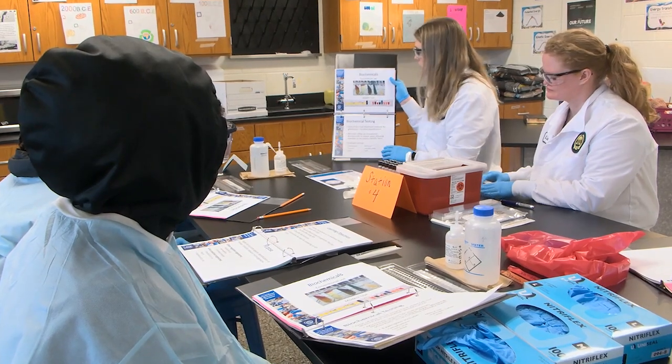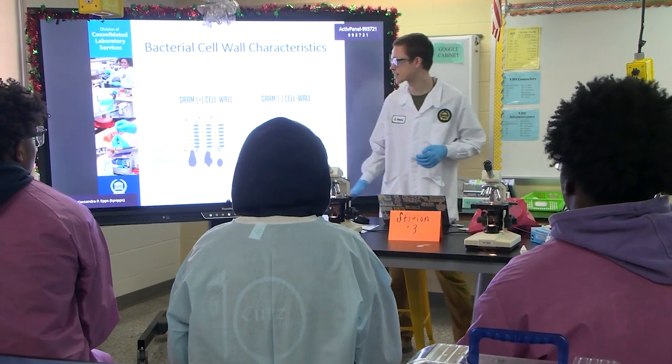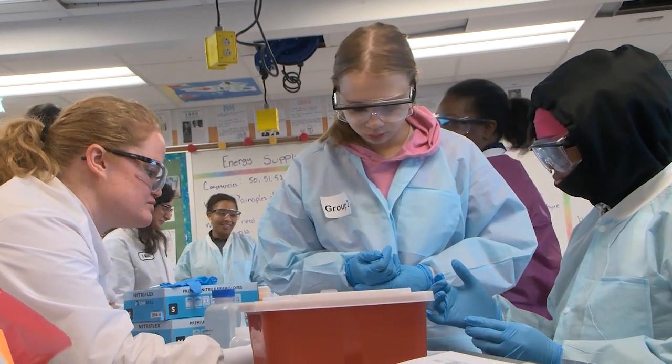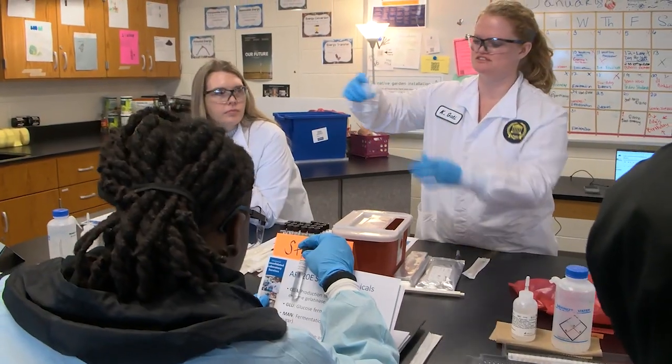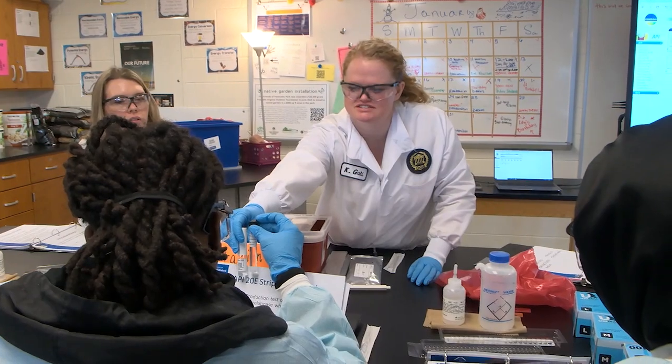Within those stations, they got the chance to look underneath microscopes. They were able to look at the processes and see how the scientists in the field actually use the equipment daily. You can see this is clear right now. So when we mix it up, we want it to have the same.